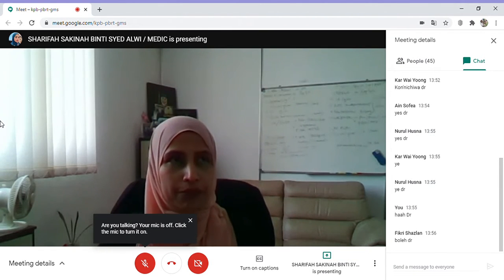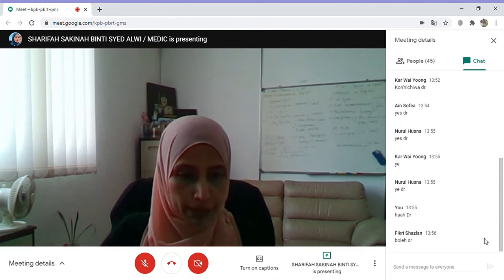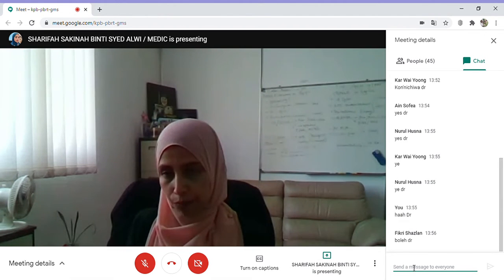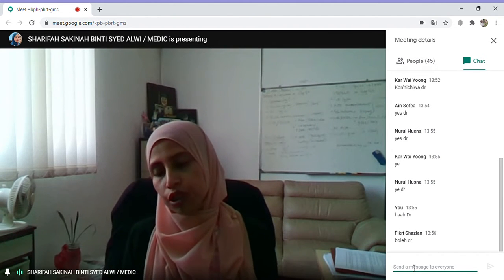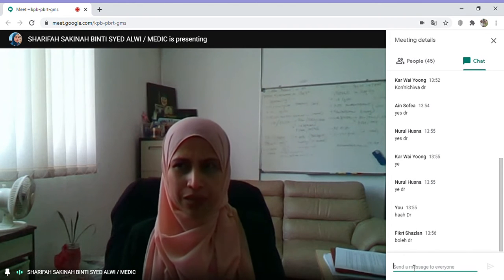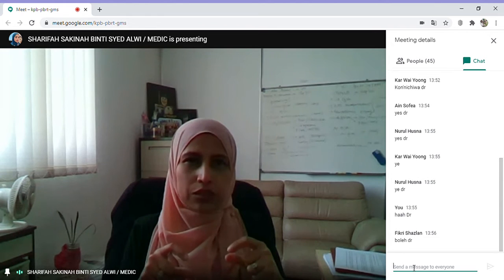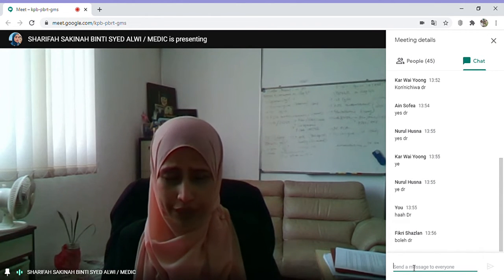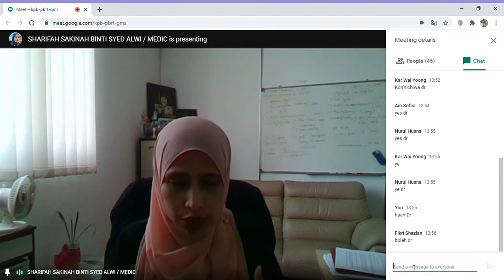PBMC is peripheral blood mononuclear cells. In the PBMC, dia ada beberapa subpopulation. Usually you cannot separate it on your own, because it is too small, and obviously you cannot see it, even through the microscope.